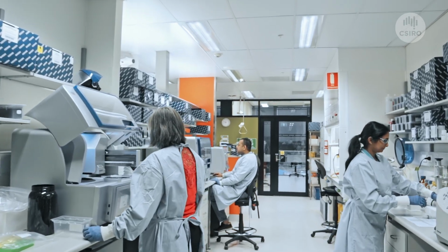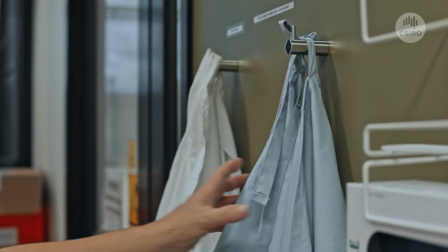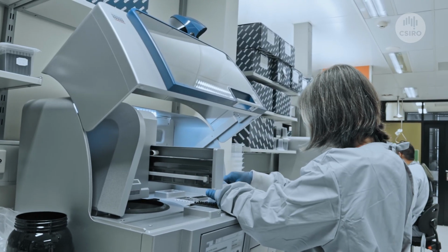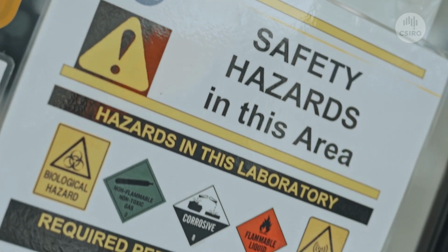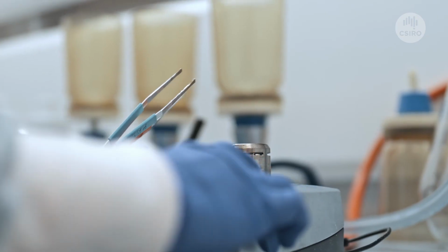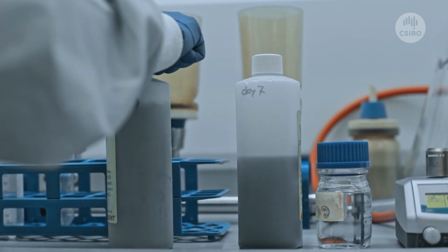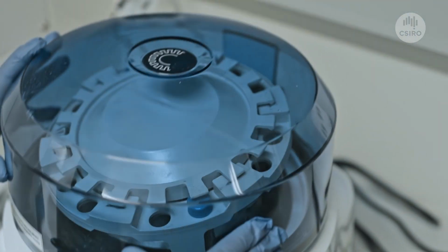CSIRO researchers have developed a set of sensitive methods for detecting SARS-CoV-2 genetic fragments in wastewater. An important aspect of wastewater surveillance is the ability to rapidly and cost-effectively gather data from a large population of thousands of individuals with enough potential sensitivity to detect a small number of infected individuals contributing SARS-CoV-2 RNA into the local wastewater systems. This pooling concept can be particularly important for regions with low clinical COVID-19 testing rates, minimal resources, or no known cases.